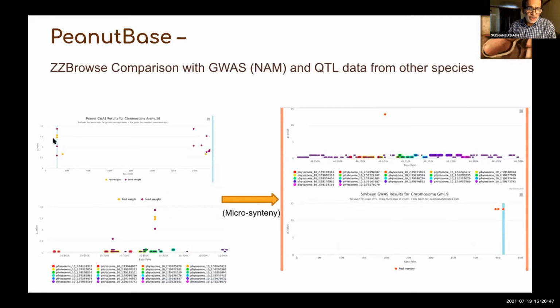I can focus on any of these and look at, from the genetics point of view, the genomic landscape in that area, particularly the synteny features. And also these colors represent the gene family of those in the narrow genomic region. And based on the microsynteny data that we have for each of these genomes, I can also traverse to another species.